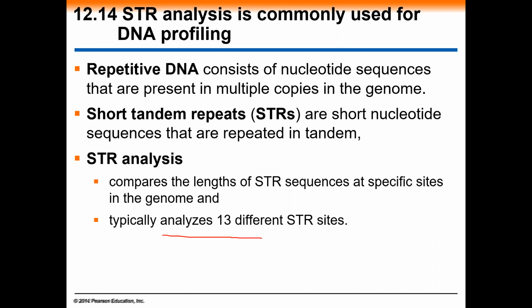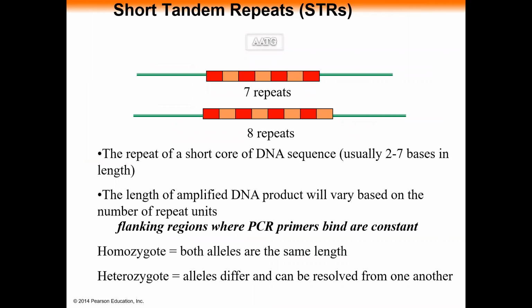And this is a lab that we would do, again, if we were face-to-face. There is a non-coding region found in all humans that you would extract from your own tissue, from cheek cells, and we would amplify it and do a gel electrophoresis to show how many copies of that short tandem repeat you had. So some people can have 7 repeats, some people will have 8 repeats, and you can determine all of this using things like PCR.